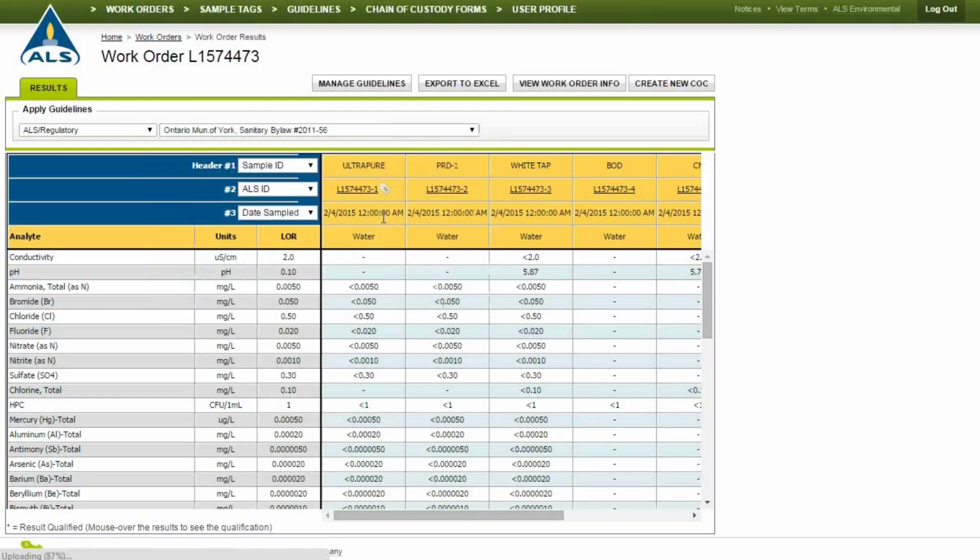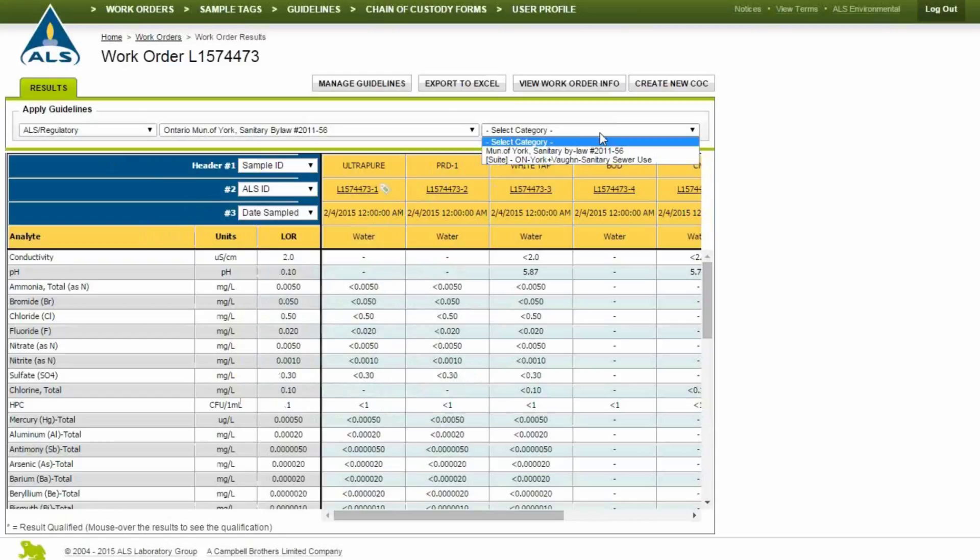First, select the guideline, then select the category. The categories are split into two options, Individuals or Suites. Suites are common combinations within a particular guideline created by ALS.